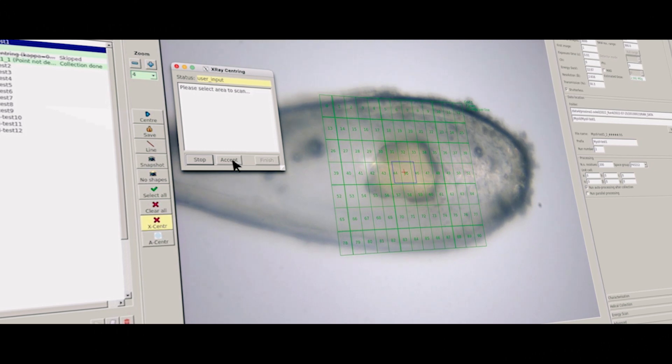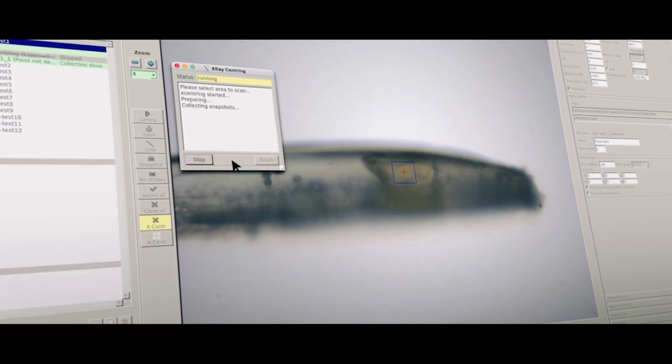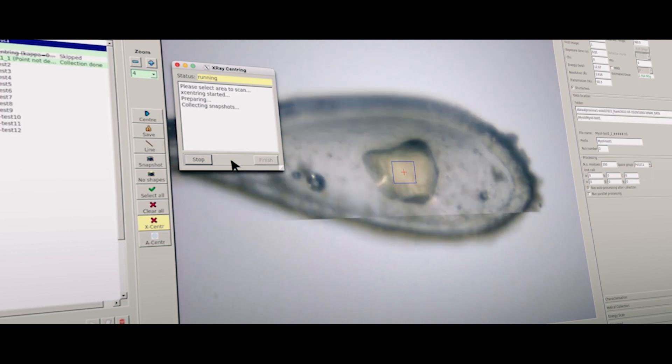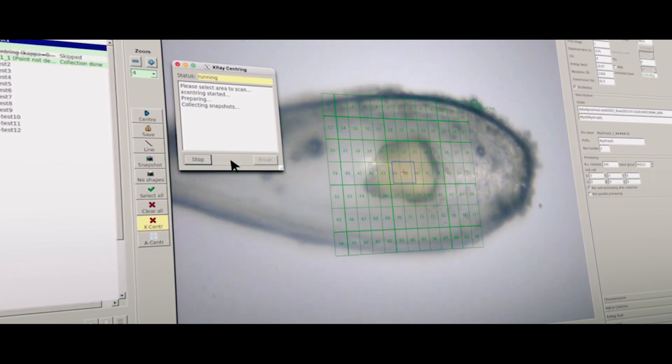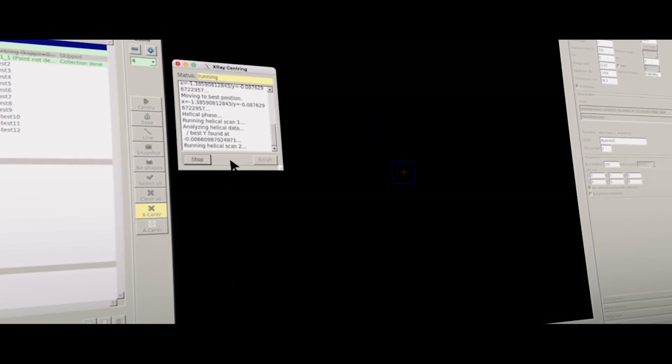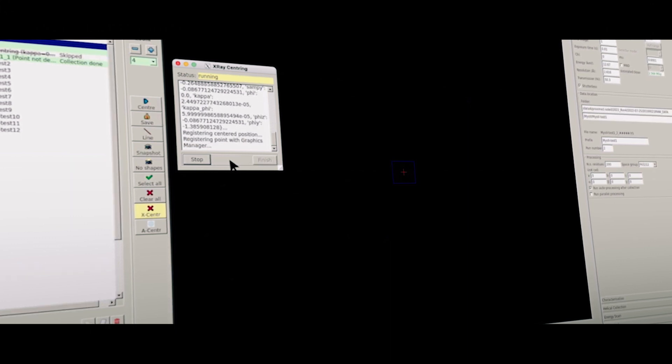MXCuBE v2 includes various protocols such as X-ray centering and grid scans, and has also been recently adapted to offer a user-friendly interface for remote operation of the beamline via NoMachine.